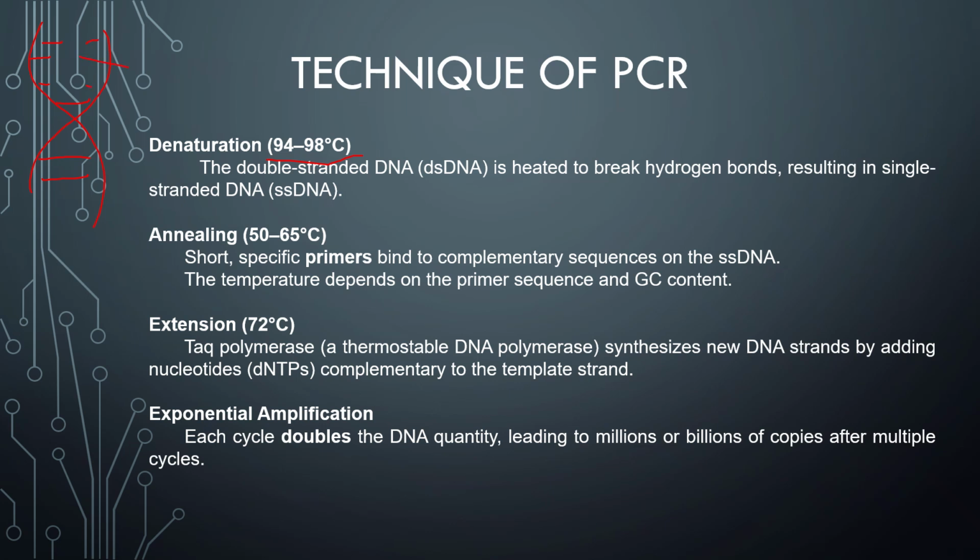This is known as the fork structure, just think of it as a replication fork. In the same way as a replication fork, it will occur for the replication, or making further strands.